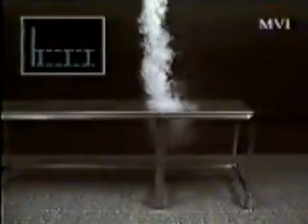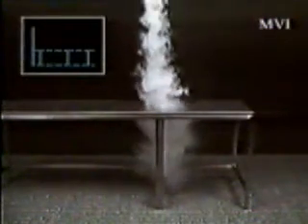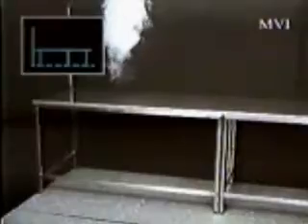It's noticeable that considerable latitude is available when perforated work surfaces are used, in that even when the surfaces are fitted into a corner or are butted together, little turbulence is caused over the work surface, and certainly there appears to be very little disturbance at the perimeter of the surface. It's clear that where solid worktops are used, turbulent contamination can occur if there's inadequate separation of the various units. It's unlikely that items on the worktop would escape being contaminated by the vortices formed.